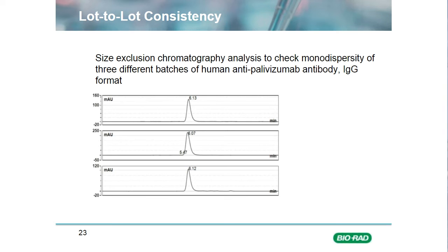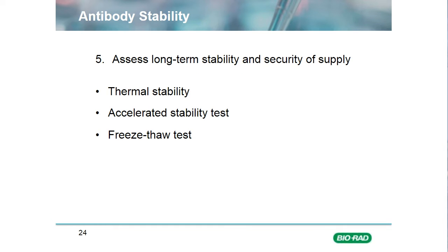So now we have covered specificity, format, the suitability in the application, the production method, and the purity of the critical raw material. So this takes us to our final consideration, which is stability. The assessment of stability in the final application is probably the ultimate test that you will need to carry out, particularly if you're making and storing large batches of, for example, antibody-coated plates. However, there are extra tests on the critical antibody reagent that you may wish to order from your service provider.